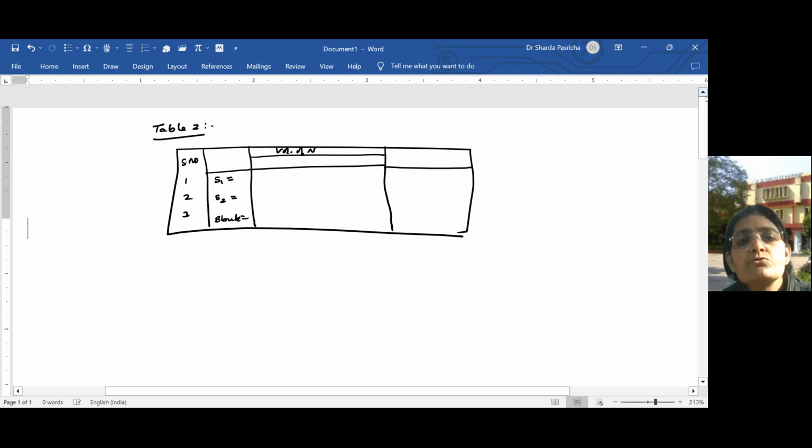Volume of sodium thiosulfate. You have to take the burette reading, initial reading, final reading. This will be the total volume of sodium thiosulfate. So this will be Vx, this will be Vy, and this will be V. The average of the two will give us V1.